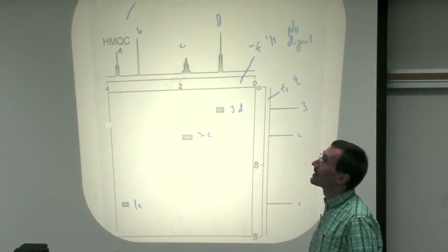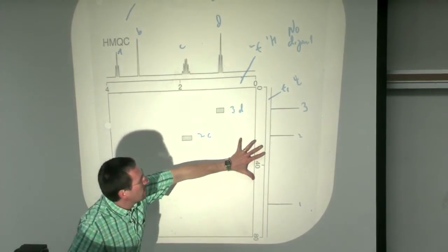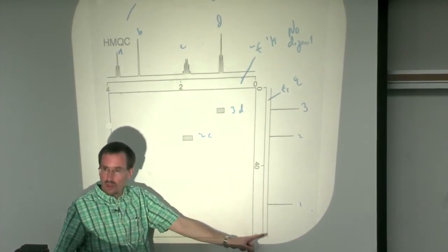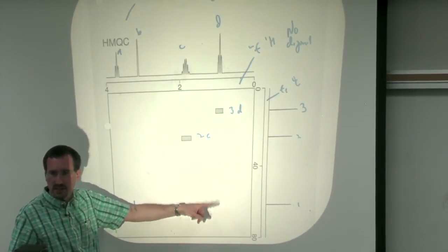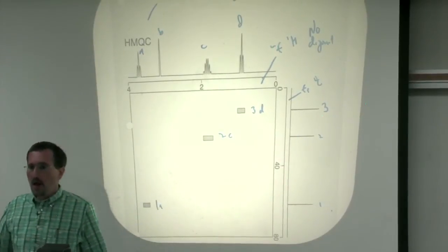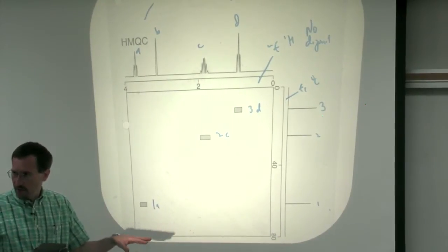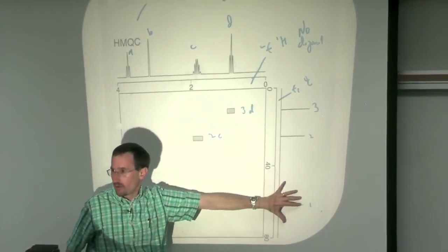And in fact, well, let's see, which way is it typically plotted? I think it's typically plotted this way because you could envision picking this up and putting it here. So I think you will always see downfield down here, but I could be wrong. It's of no consequence. Let me put it this way. It's of no consequence whether we go from 0 ppm to high ppm or the other way around. You will also see, maybe in the textbook, you may see a few HETCOR spectra given for some of the compounds. In a HETCOR spectrum, the C13 is going to be up here, and the proton will be down here.